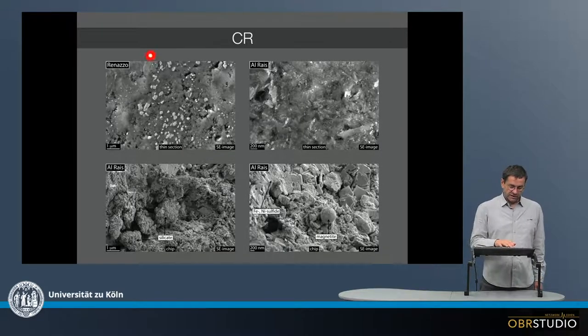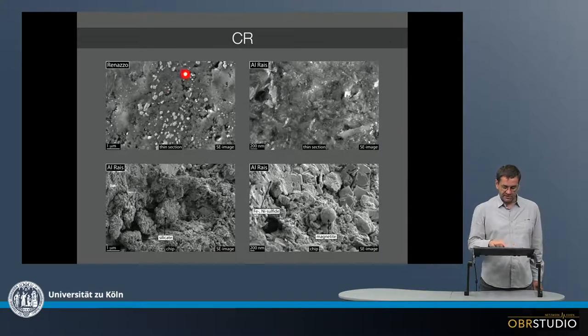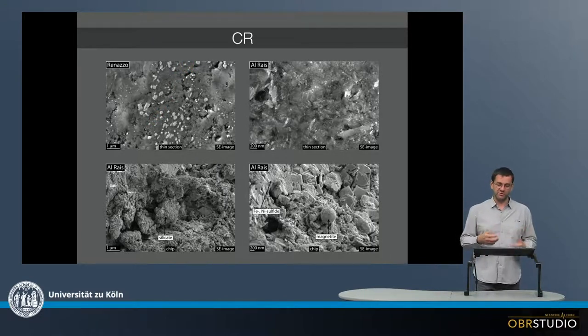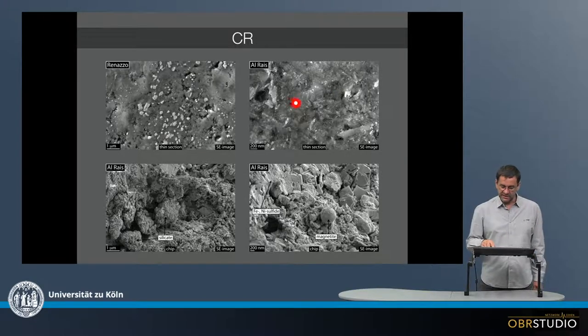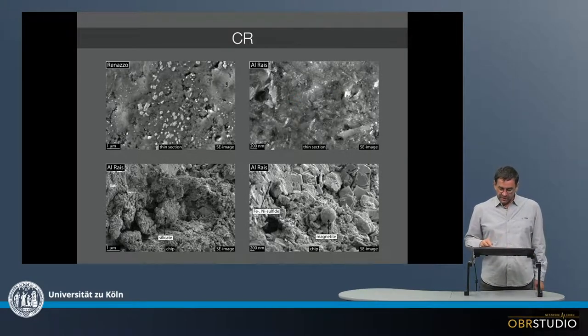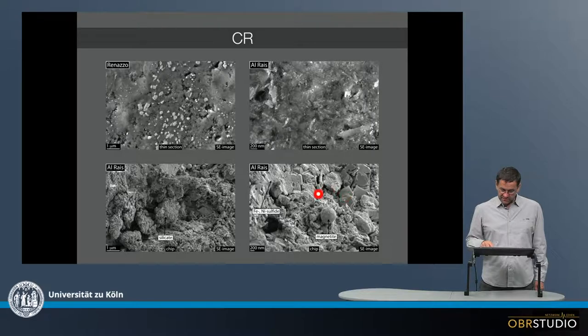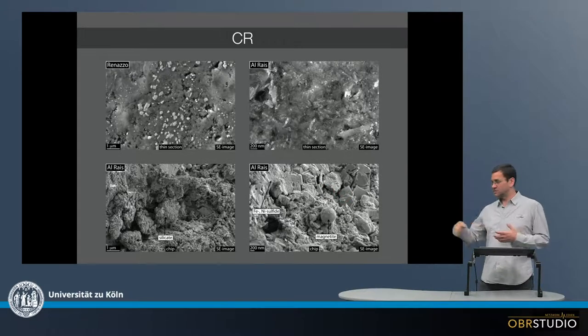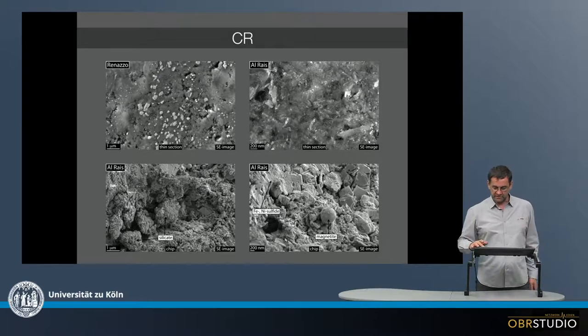In Renazzo, the CR chondrite, it looks rather like a homogeneous mass, so it also looks like some overprint on the parent body, same as here in Al-Rais. And sometimes there's also again these magnetites, these are quite easy to identify, this is why they are on every second image or so.